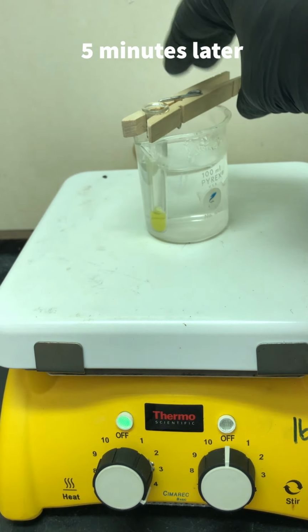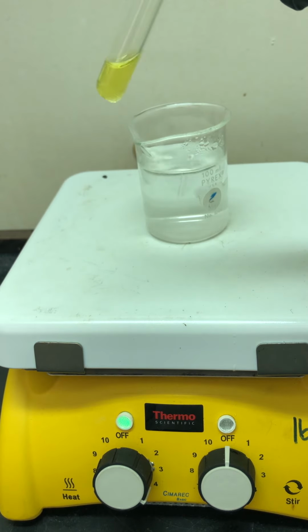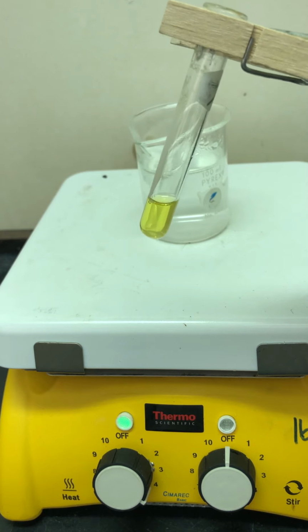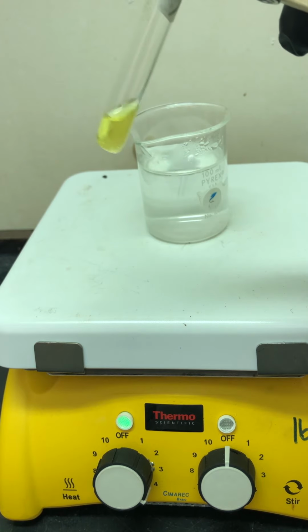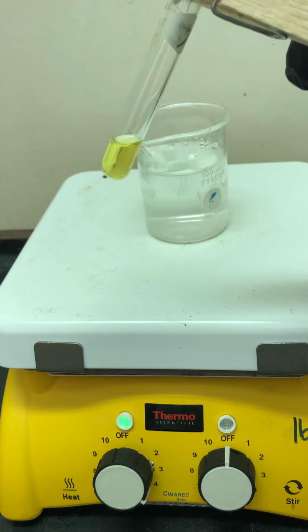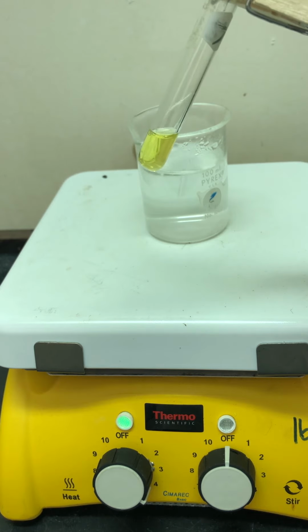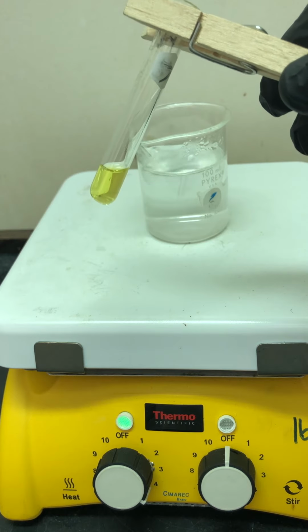Okay, the 5 minutes are up, and as you can see, all of our iron 3 sulfide black precipitate has dissolved. If you still have some residual solids at this stage, what you might want to do is respin this. And you don't have to decant. You can test the supernatant of that directly. But mine has totally dissolved. And you see the yellowish color. Sometimes, iron 3 will reduce to iron 2. And somewhere in there, you get a yellowish color. So I'm going to take this back to my bench. And we're going to do the final test to confirm the presence of iron 3 ions.